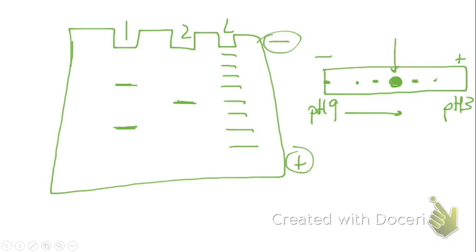And this right here is the pH that equals the pI, right? That'll be the isoelectric point. It's known as isoelectric focusing. It's a way that we can determine the isoelectric point of a protein. And what we can do is couple these two together and do what's known as a two-dimensional gel, where we look at both the isoelectric point and the size of these proteins.